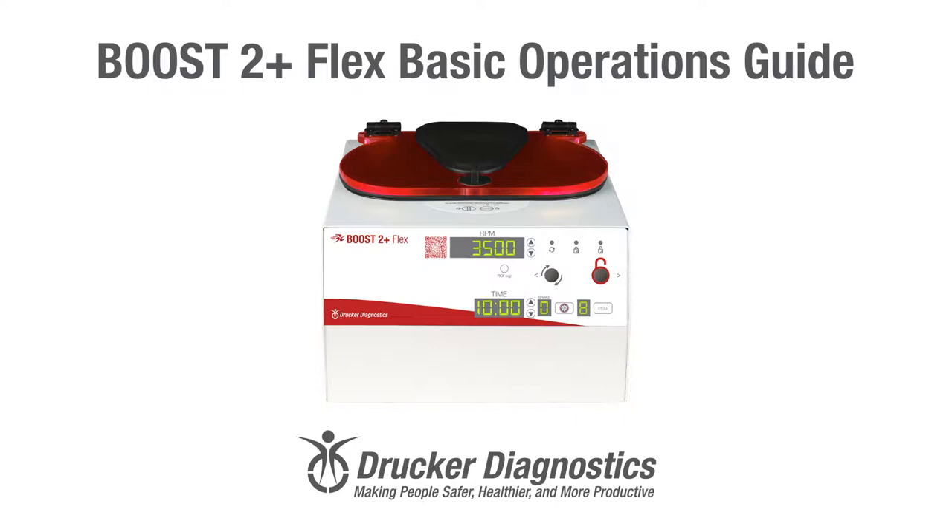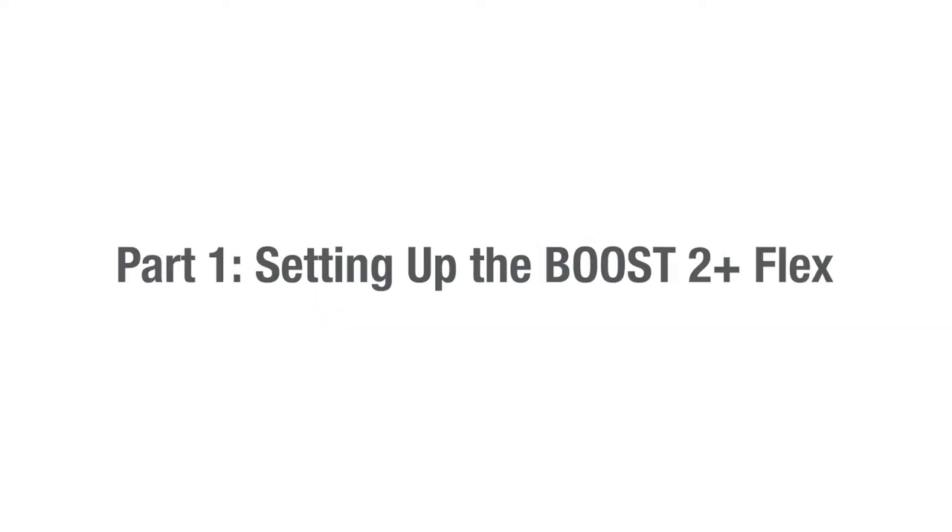Hi, I'm Dawn with Drucker Diagnostics, and today we're going to review the basic operations of your Boost 2 Plus Flex centrifuge. If you're looking for something specific, take a look at the bottom of your screen. This video is divided into chapters so you can easily find what you need. Boost 2 Plus Flex Basic Operations Guide, Part 1.